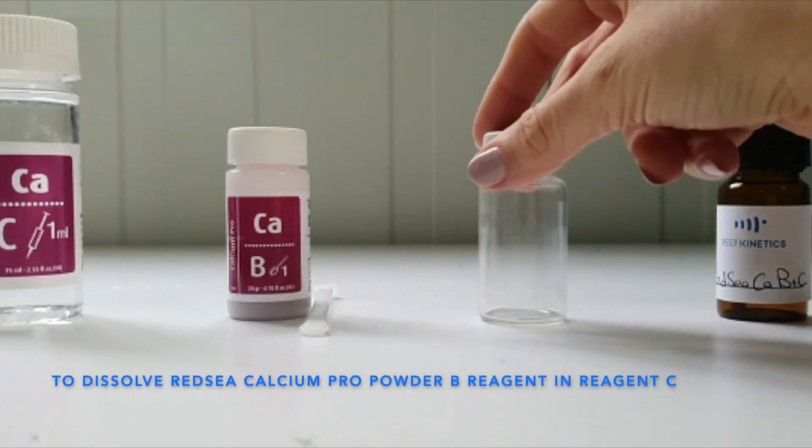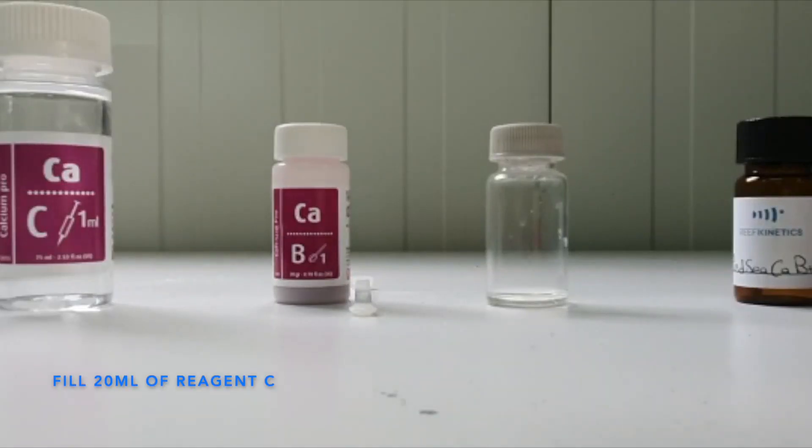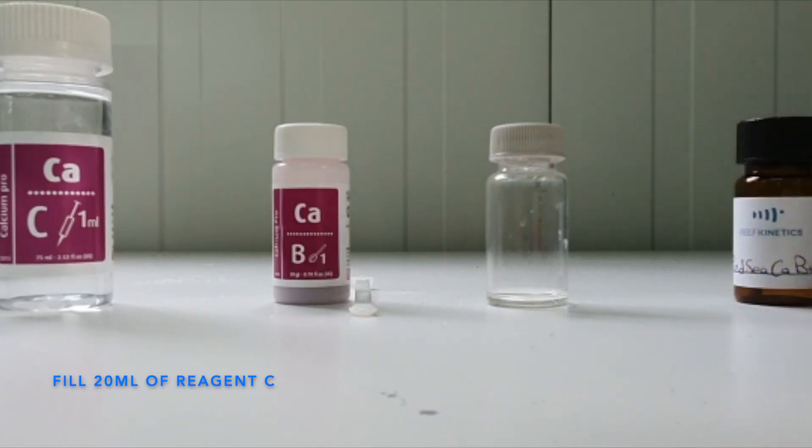Use a Red Sea transparent vial. Fill the transparent vial to its neck with Red Sea reagent C. This volume is around 20 mL.